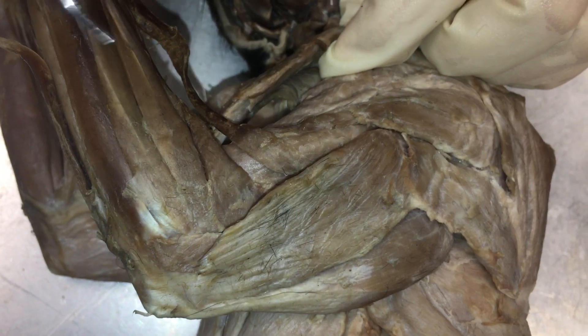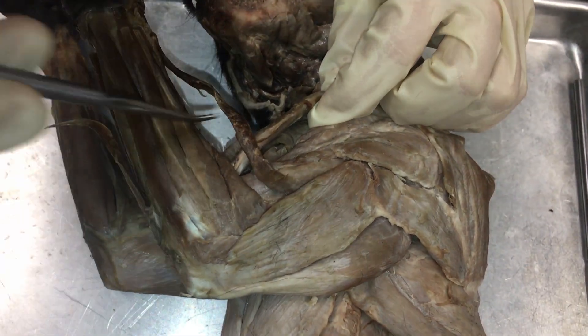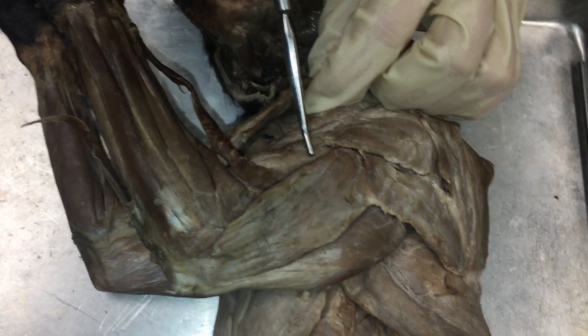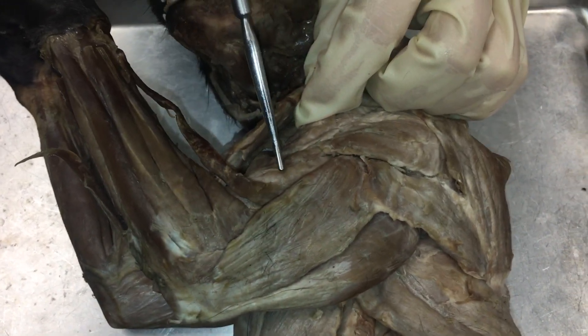Brachialis. And if you're ever confused, just know that brachioradialis, which we did mention in the forearm video, is connected to the brachialis up at the top. So, brachioradialis and brachialis.